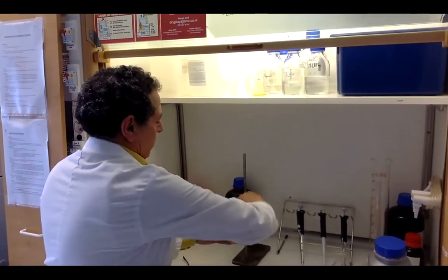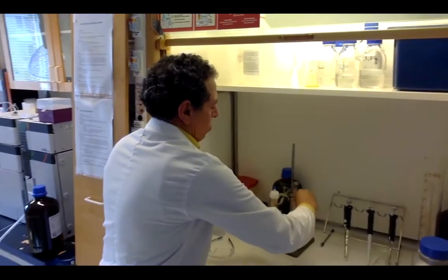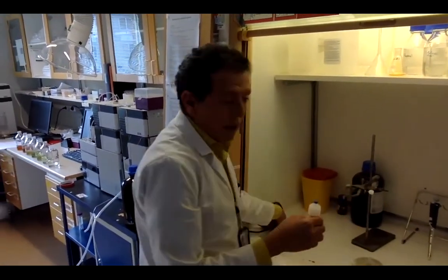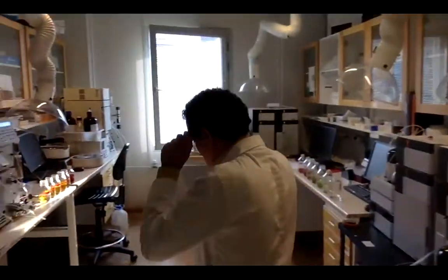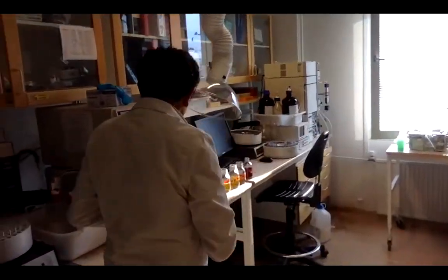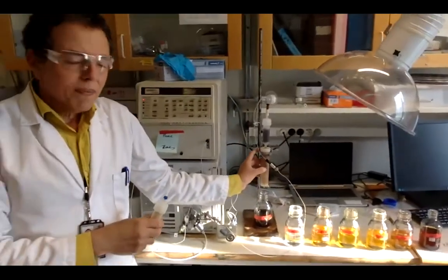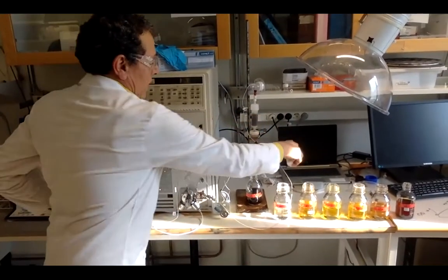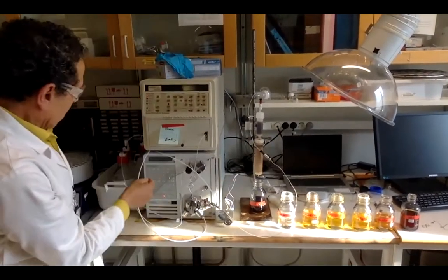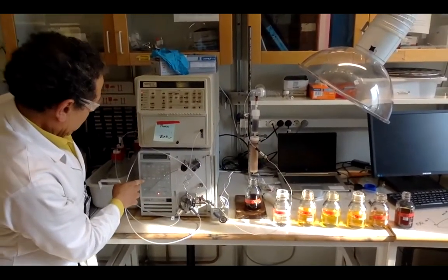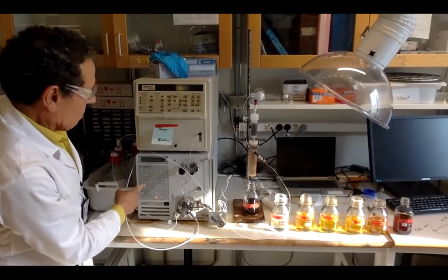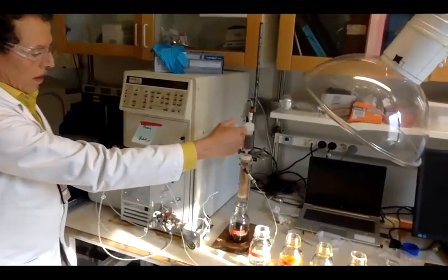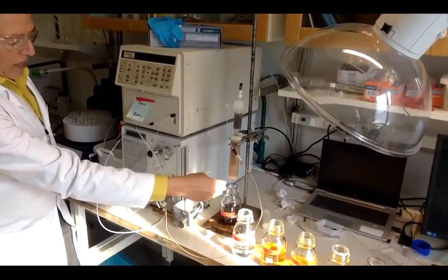Now the column is ready to be connected to the whole system. We connect it here. This is from our program to save time. Then you start the machine, and it will make the elution as you can see.